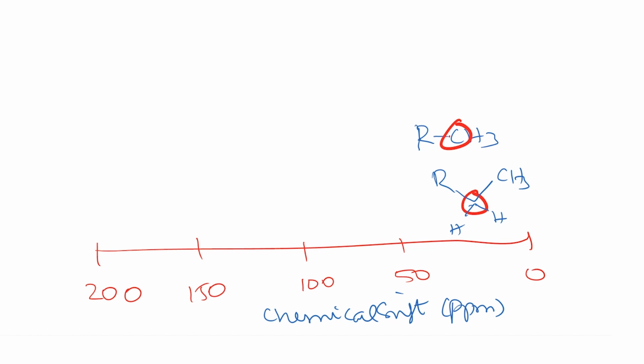Okay. And much like the proton NMR, the region between 50 and 100, as we saw in proton NMR, it was between 3 and 4.5, is when you have an electronegative atom such as in an ether, R O CH2, let us say R prime. Okay. So, this carbon again shows up between 50 and 100. Okay.